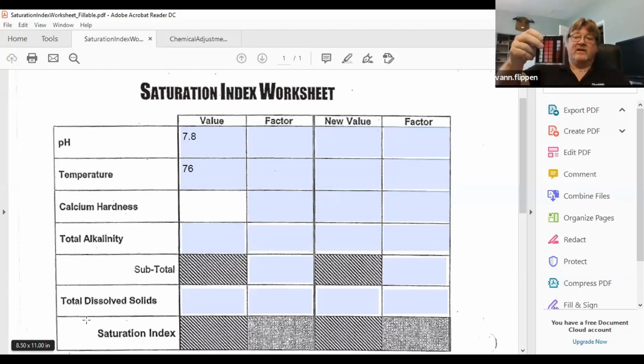That's 11. And it got really pink. If I added another drop, it's not going to get any darker in color. So I'm just going to go with that 11, even though I added 12, because my color is not getting darker when I go to that next drop.